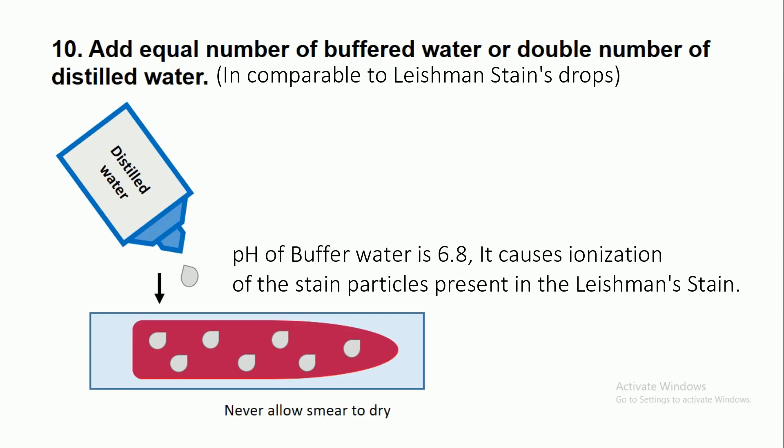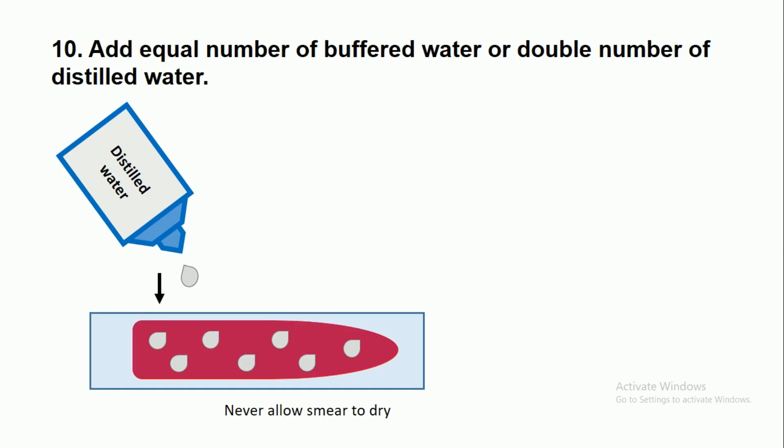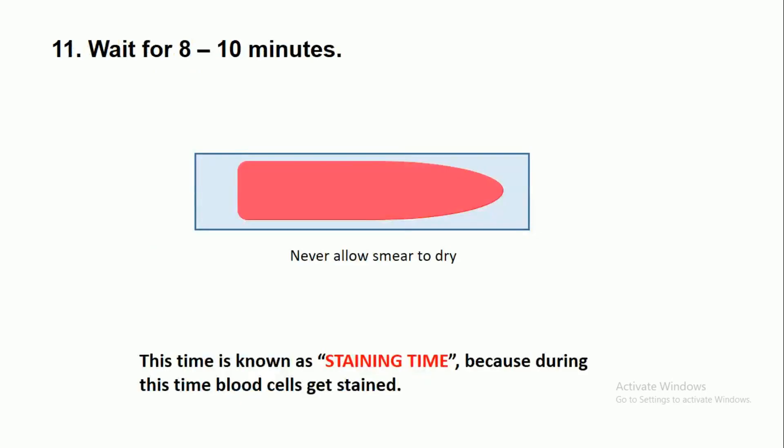After one and a half to two minutes, add an equal number of drops of buffer water or double the number of drops of distilled water. After adding the distilled or buffer water, wait eight to ten minutes, but during this time never allow the smear to dry. This period is known as the staining time, because during this time the blood cells get stained.